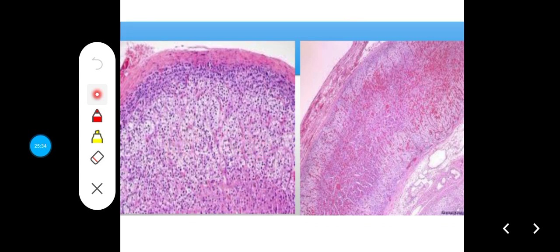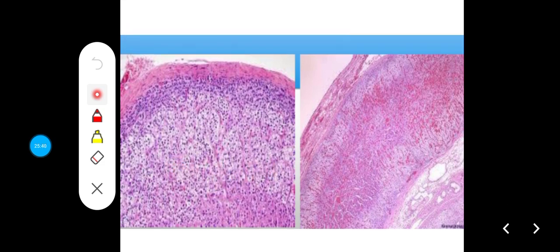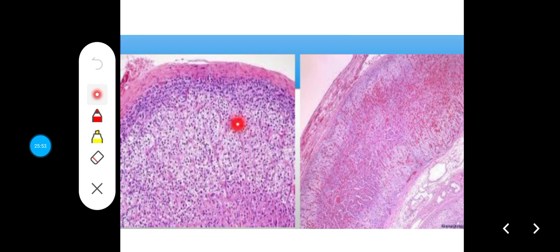So this doesn't look like the pituitary gland, because in the pituitary gland, you see the two zones separated by a clear demarcation of a poorly developed pars intermedia. You can't find the same thing here.